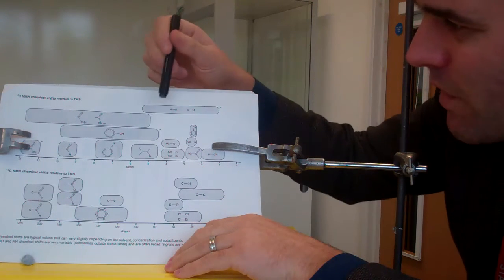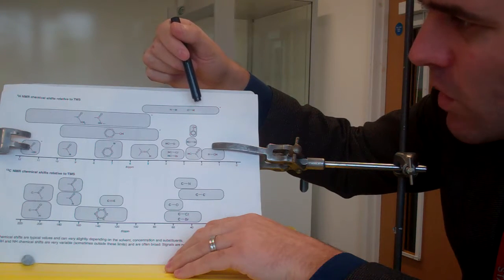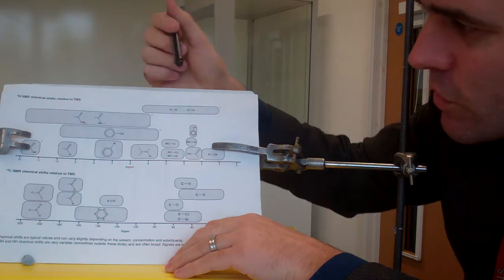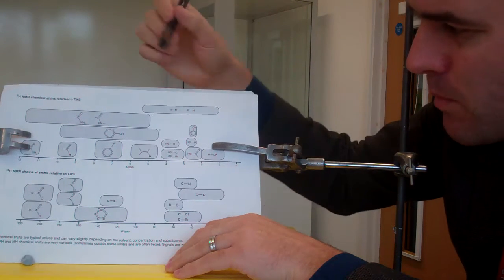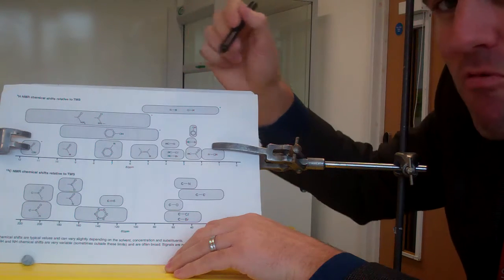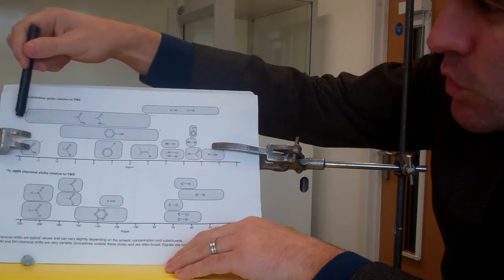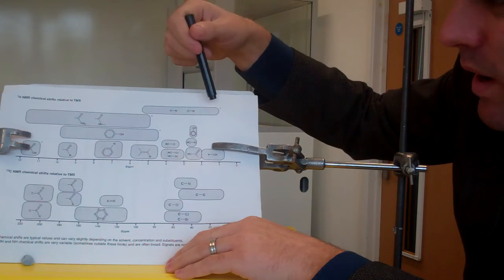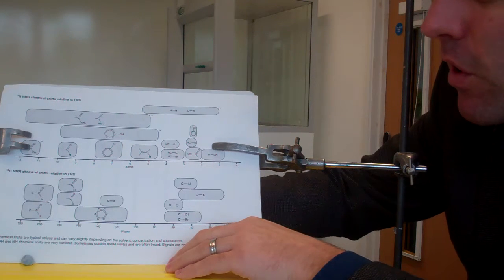These ones here, the asterisks, are hydrogens bonded either directly to oxygens or to nitrogens, and one over here as well, and they tend to be broad. So a lot of these peaks are very sharp, almost needle-like. These ones are a little bit more rounded, so sometimes that can be a clue when you're looking. But if you look, they have huge ranges where they could be. So where it is on here, the parts per million, doesn't tell you a huge amount. It's just a rough guide.